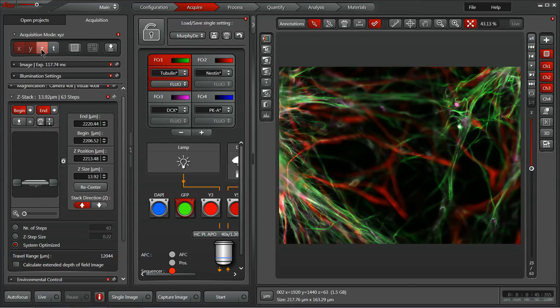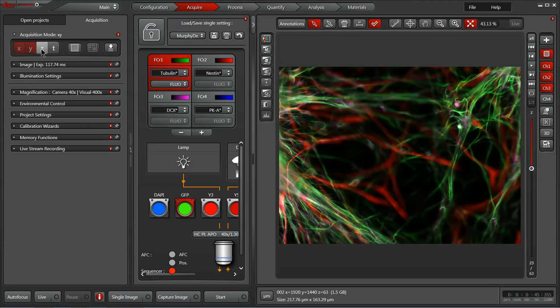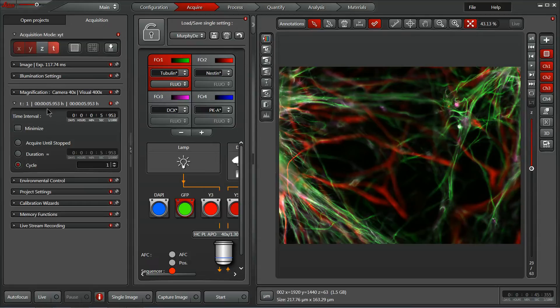Moving on from the Z-Stack, let's look at the time-lapse dialog. By activating time-lapse within the acquisition mode, the new dialog appears, within which we can adjust the time interval between time points by clicking and manually typing in a 15-second time interval.